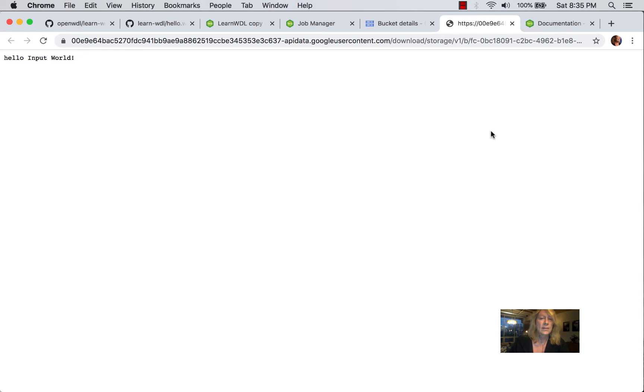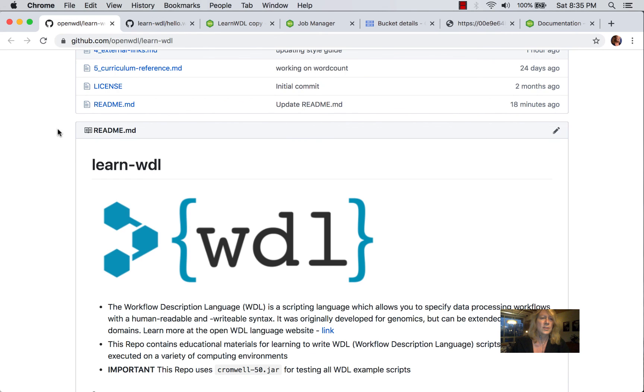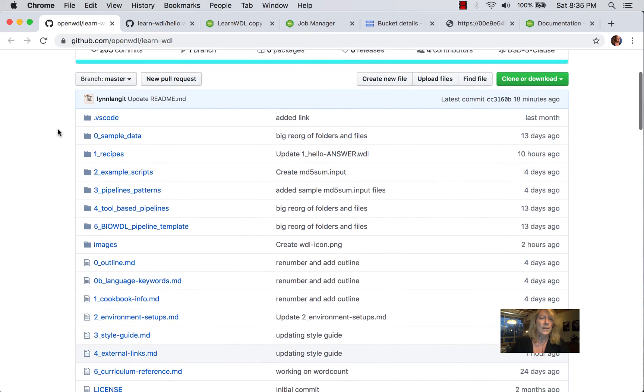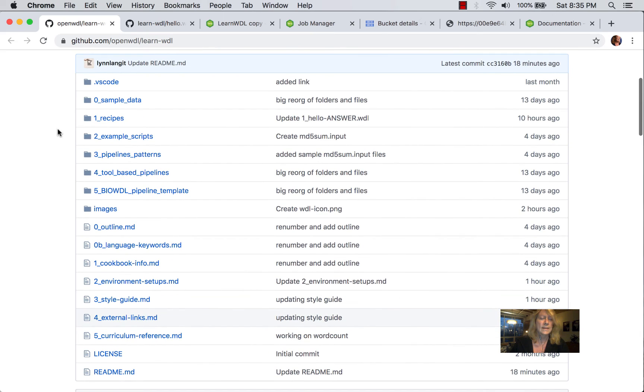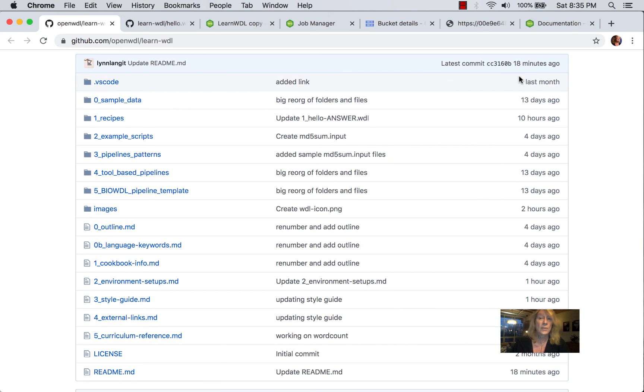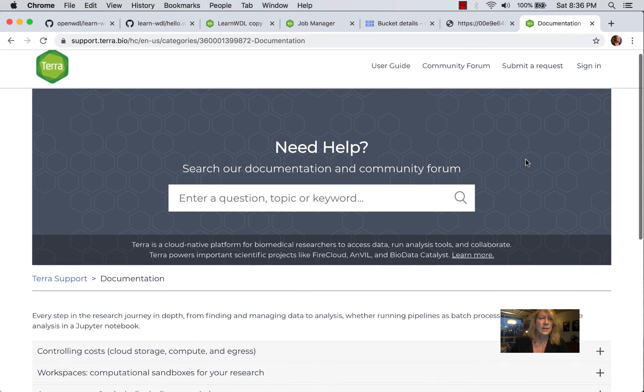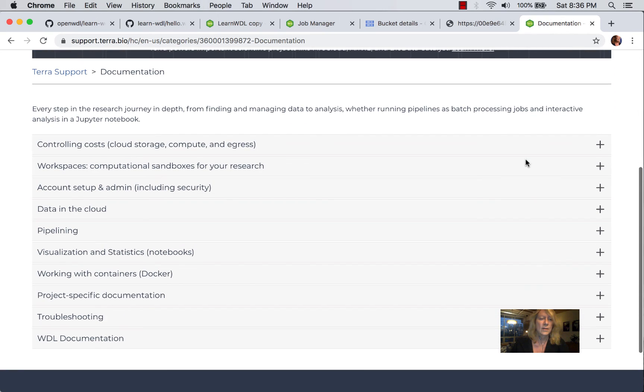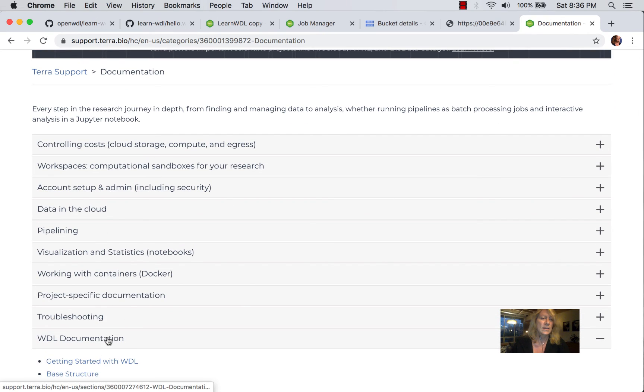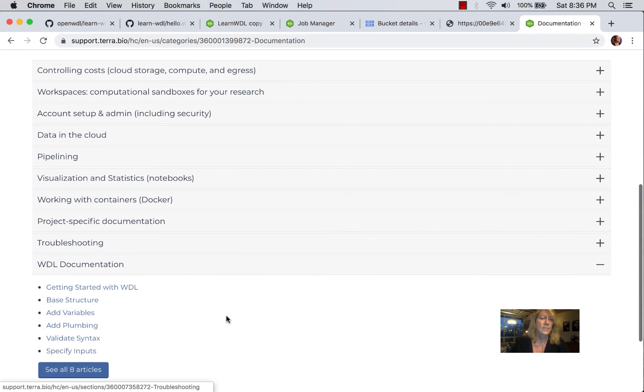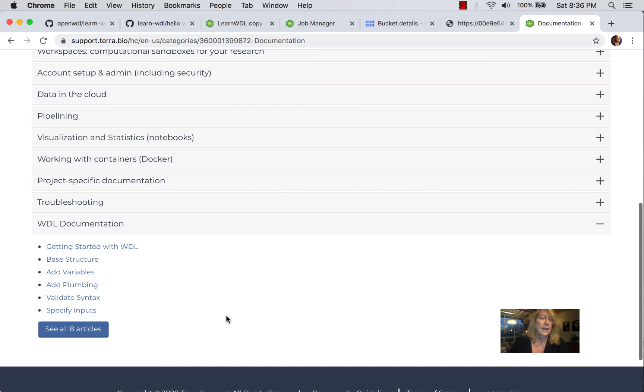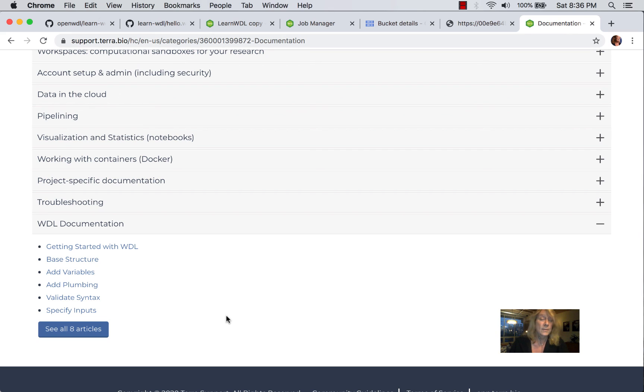So because the Terra system runs with WDL, in addition to the information that I'll be creating in this course as I continue to develop it, I will link to existing WDL information. There's quite a lot of it in the Terra system. So here's the Terra documentation. And you can see they have a lot of WDL documentation.